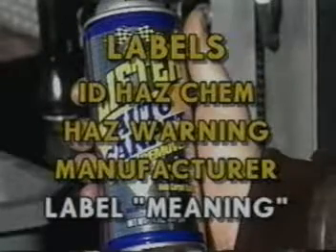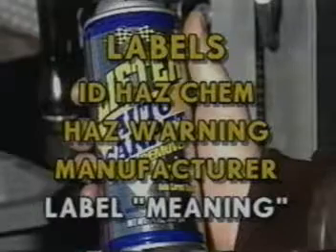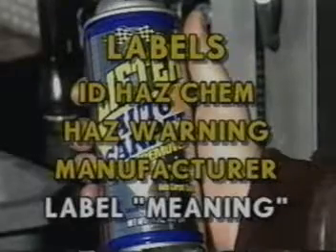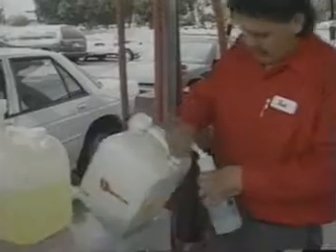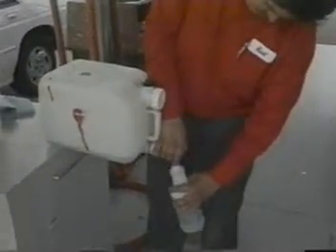You may use signs, placards, symbols, batch tickets, or printed operating procedures in place of labels on individual containers, as long as the meaning is fully understood by the people using the chemicals. Where the chemical is intended only for the use of the employee making the chemical transfer, labels may not be required. This means the container must be used only by that person and must be used only during the work shift. If the container is to be used on another shift or by another person, then a label is required.